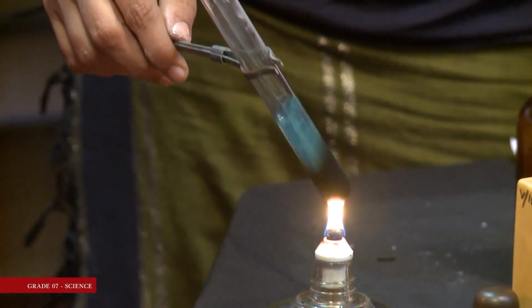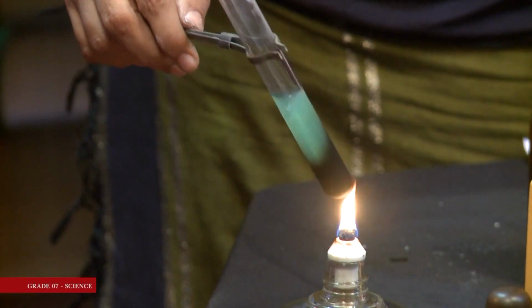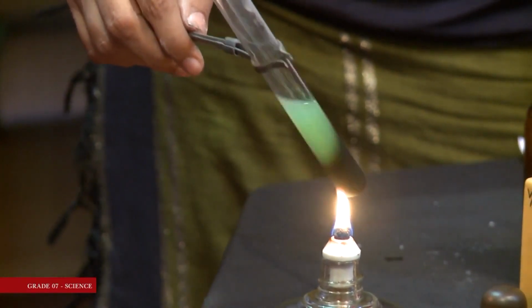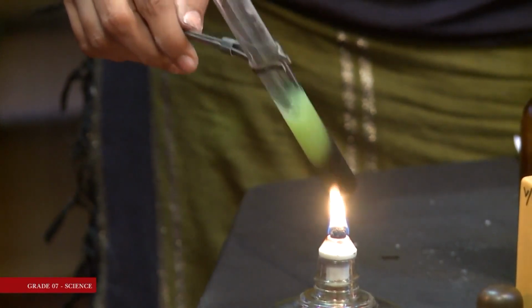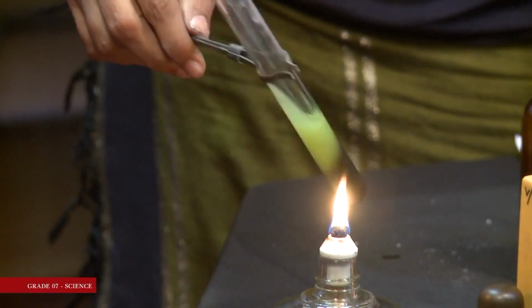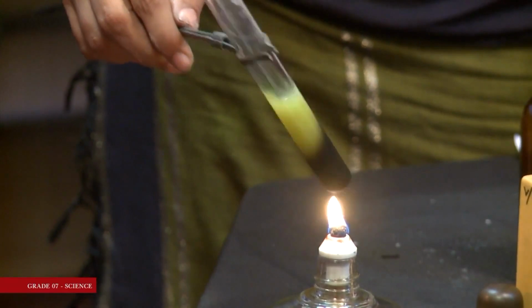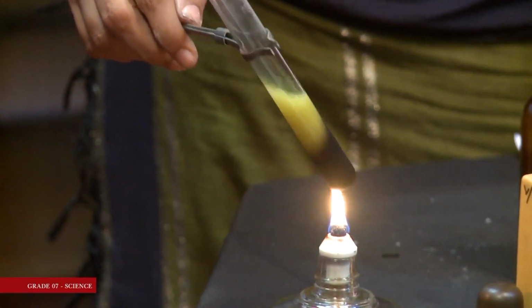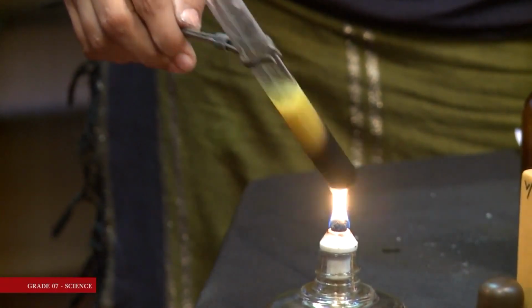Yes, you can observe the blue color is gradually turning into which color? Yes, very good. The color is gradually turning into green. Then I continue heating. The green color is turning into yellow. Now the solution is yellow now. I am heating the test tube continuously. See what happens.